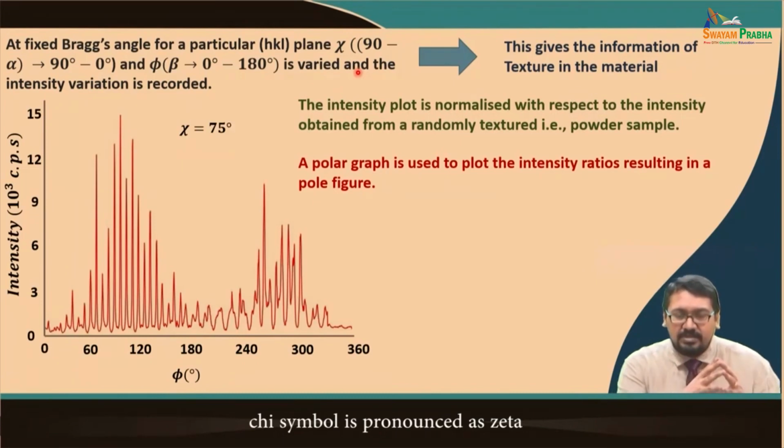So, the polar graph can be plotted from several such graphs, and then the pole figure can be obtained, right.